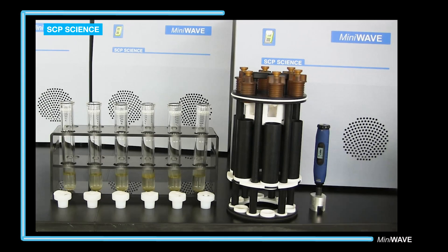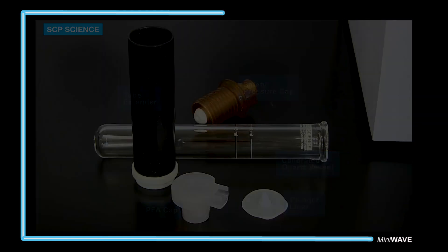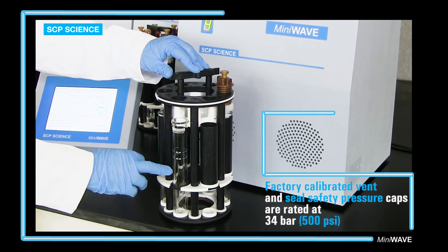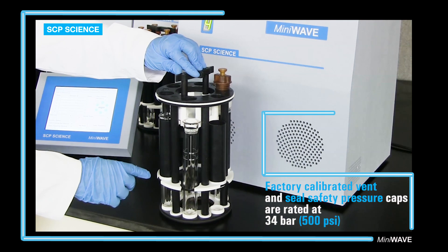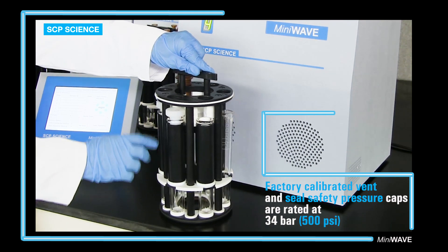On the left is the vessel rack, which allows samples to be prepared before they are placed in the digestion rack. Here are the components of the digestion racks and vessels. It is straightforward to place the rack in the cavity. The safety pressure caps allow for safe venting after digestion. The rack can be rotated on the bench top for easy loading of the sample.